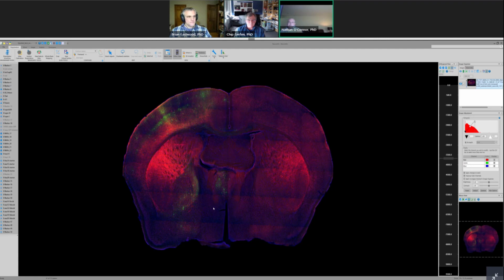So it's really teaching it. It really is important, especially for a case like this where the intensities vary in expression, to let it know what things are and are not as you train. Yeah, that's right. As Brian pointed out, the LOG is part of it. It's not just the strength of the intensity of the area; it's the contrast between that area and the surround. That's the part where the neural network does a very good job of distinguishing variations.